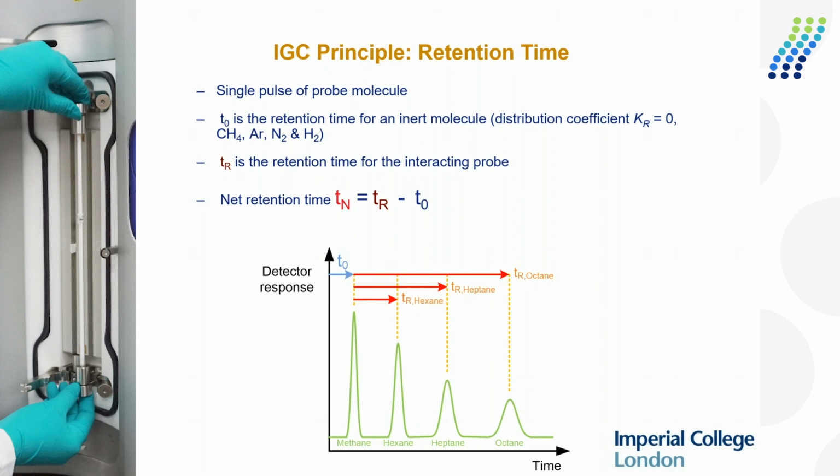And these alkane molecules have dispersion forces, and those dispersion forces will allow me to get a measure of the surface properties of my unknown powder, the powder that I wish to granulate. So what we're going to do is a series of injections in our column, and you can see here C10, C9, C8, C7, C6. These are injected molecules.